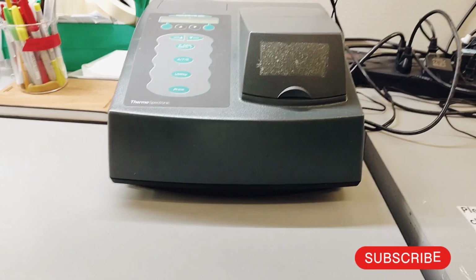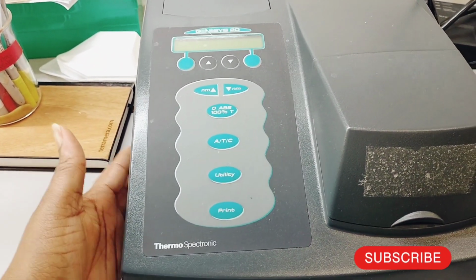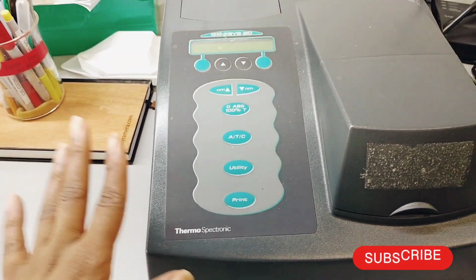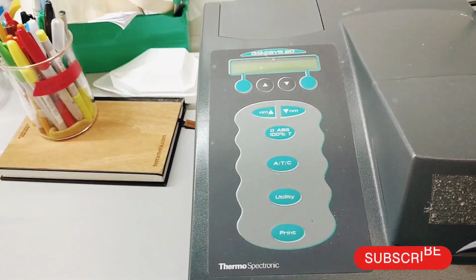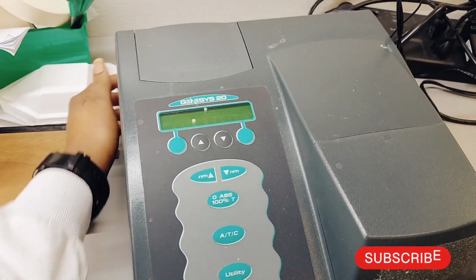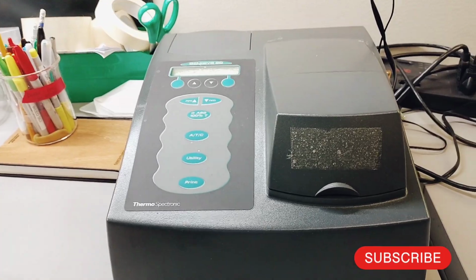So we'll get started. This is a spectrophotometer, and I'm going to use it to quantify the inoculum to have an idea of how many cells are in the inoculum once I make it up. It takes a while to warm up and come up to the right settings. So another thing I like to do when I come in, if I know I'm going to use it, is to turn it on. Okay, I think it's unplugged, so let's plug it in.